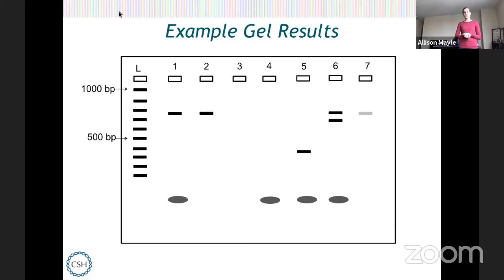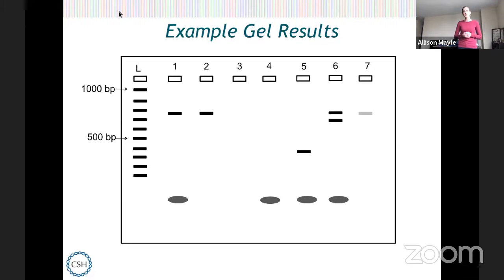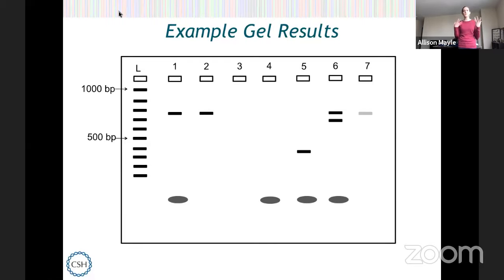How about lane four? Do we think that's also a gel loading error? There's something different between lane three and lane four — in lane four, we can actually see the primers down at the bottom. So I don't think this is a gel loading error; I think person four actually got their DNA into the well because we can see the primers. I think their PCR just didn't work. Sometimes we make it sound like PCR is super easy and all you have to do is pipette things and put them in the thermocycler. There's actually a lot of things that can go wrong in PCR, and many people have spent many hours troubleshooting.